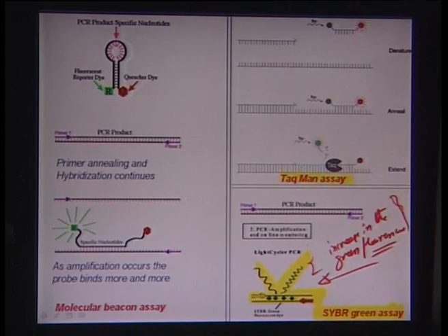Now in a PCR process, as we know, there are about 30-40 cycles of different thermal steps. So you have to take this reaction through a step of 95, through a step of about 50 degrees, and then another step of 72 degrees. Due to this rapid thermal cycling, there is always a tendency of the junk molecules to go away with time. Essentially, if it denatures or renatures, it all is jumbled up, and beyond a certain time it really starts disintegrating, because there are no specific end recognition sequences to pick up the junk.